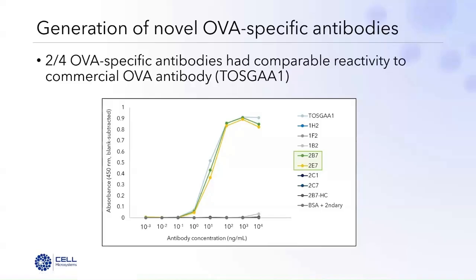There's a lot of different reasons that this could happen. Obviously, producing antibodies in a producer cell line is not straightforward, and it's entirely conceivable that something about those sequences did not properly express or produce antibodies. But I do think it's really fascinating that the two antibodies with the identical sequence both performed extraordinarily well with the exact same antibody expression compared to the other two.